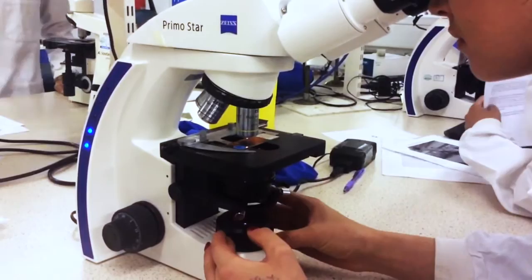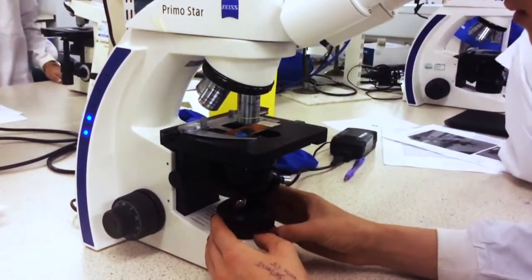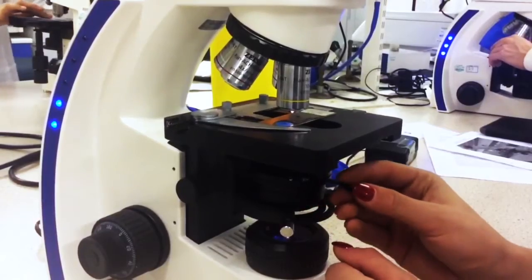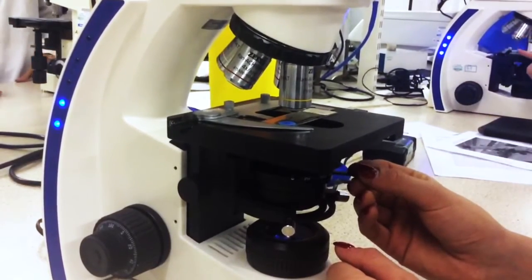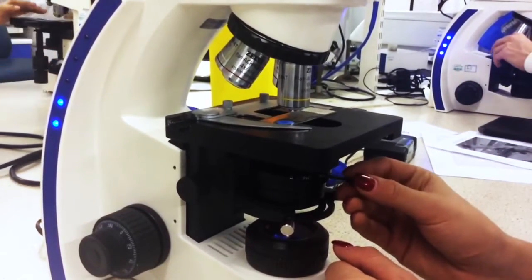Ensure the black circle is just absent from the field of view. Open the field diaphragm. Close the condenser diaphragm using the slider. Gradually open until the point is reached where the preparation is adequately illuminated.